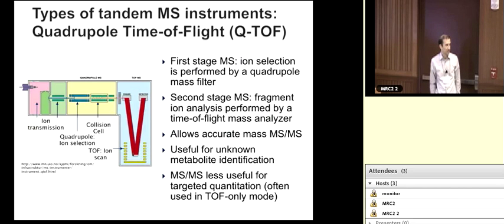I think it'll depend on the assay, right? If you're trying to replicate a study that's already done and it's a quantitative method and you're following a published protocol, then we can reproduce it, and that may be a triple quad. But in many cases, when we know that we can do just as good a job on quantitation on an instrument that is compatible with untargeted profiling as we can on, say, a triple quad, then absolutely, I would often recommend that.